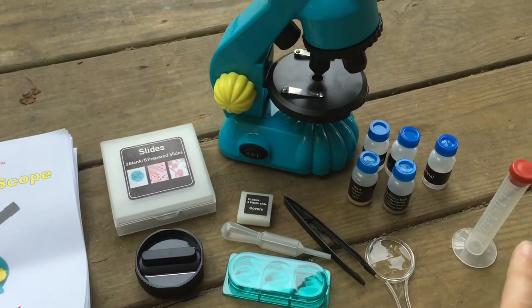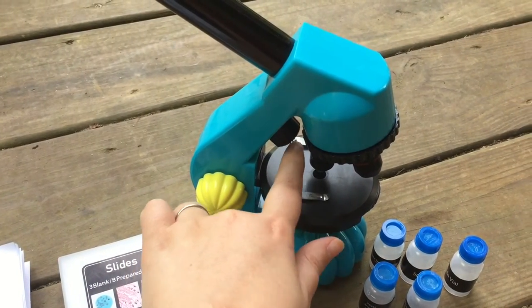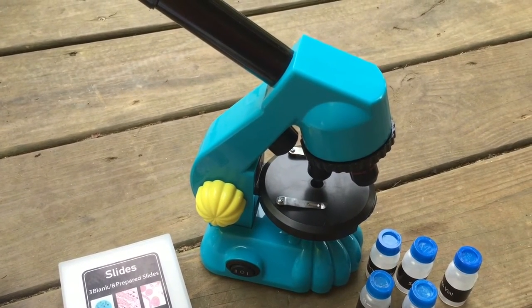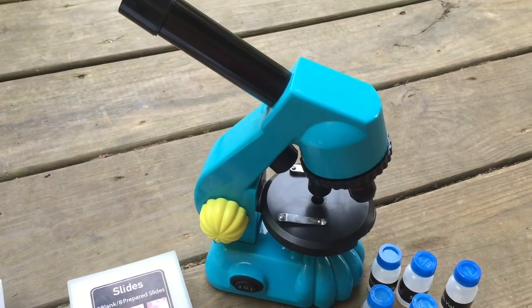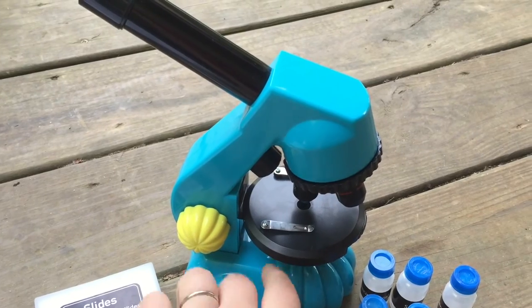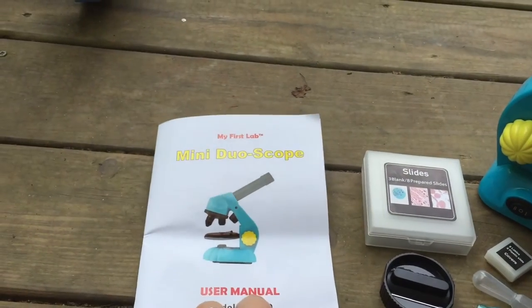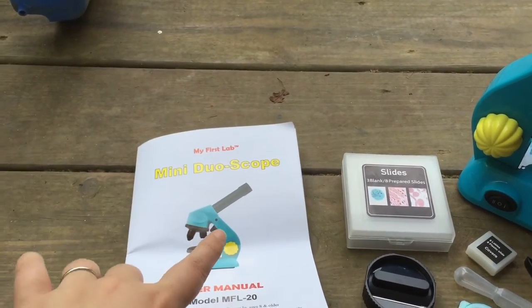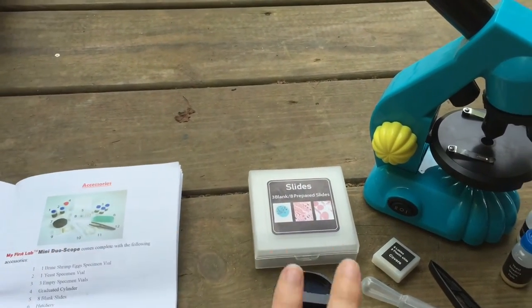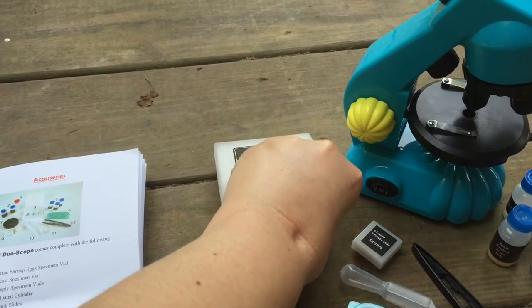Even just the stuff that comes in the box is amazing for that price. You get your microscope which has an upper light and a bottom light — one is called a stereoscope view, which is for solid objects like if you were looking at a penny, and the other is your compound microscope light. You will need three double-A batteries, sold separately. It also comes with a lab guide which explains how to use the microscope, what's in it, ideas for experiments you can try.